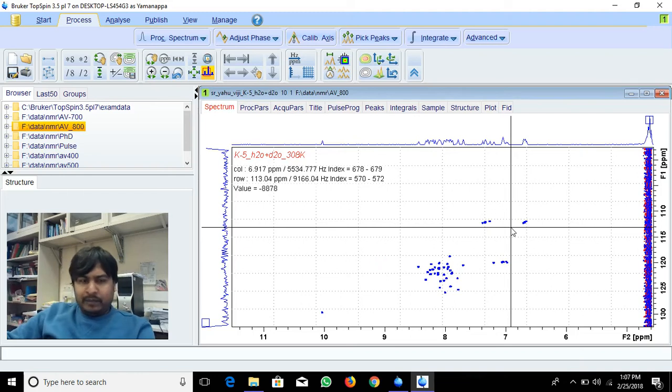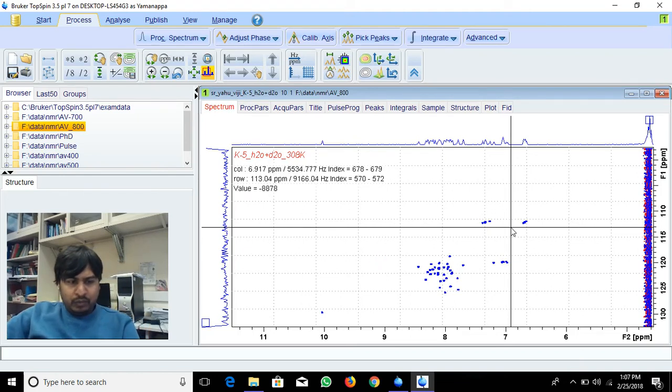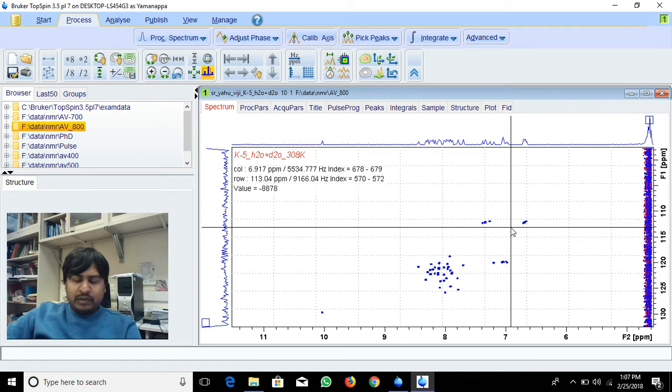Hey, in this video I'm going to explain how to do peak picking in 2-dimensional NMR spectra.